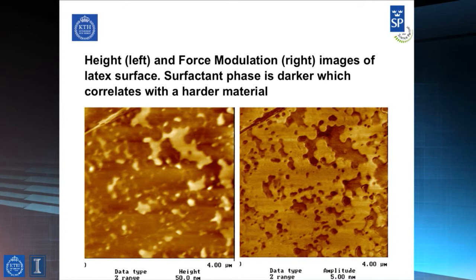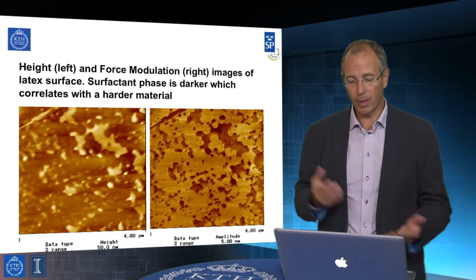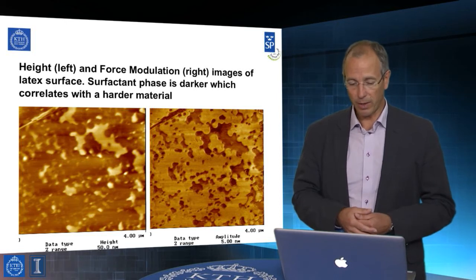But we see that we can associate material properties with the topography corresponding to the surfactant. So there's very, very clear correlation between these two images, and we can understand the relative hardnesses.